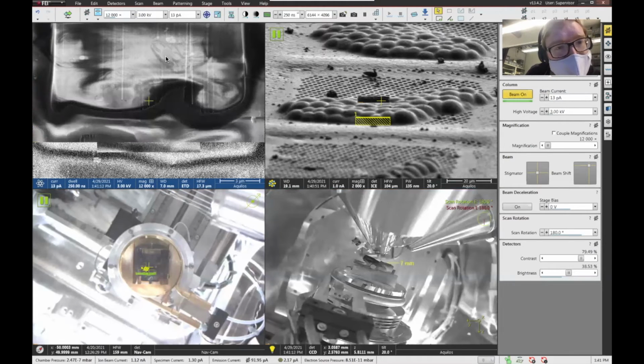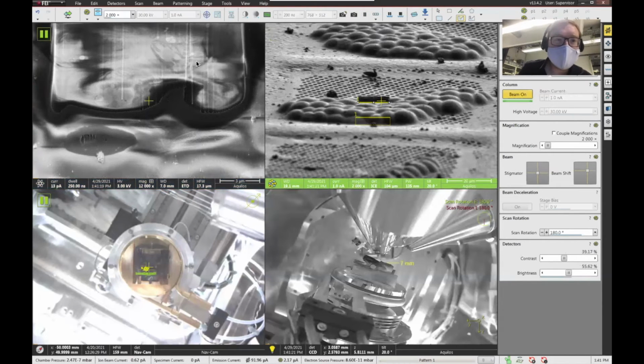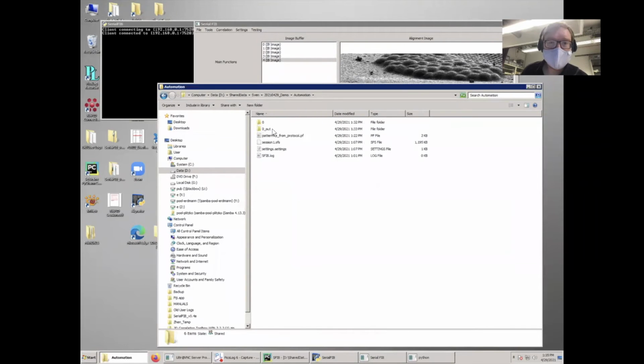This might actually be, I don't know, Chlamy experts, is this Rubisco? I don't know. Yeah, the pyrenoid, I guess, I don't know. And then it just goes through the entire volume that way and saves the images into wherever you set up your system.